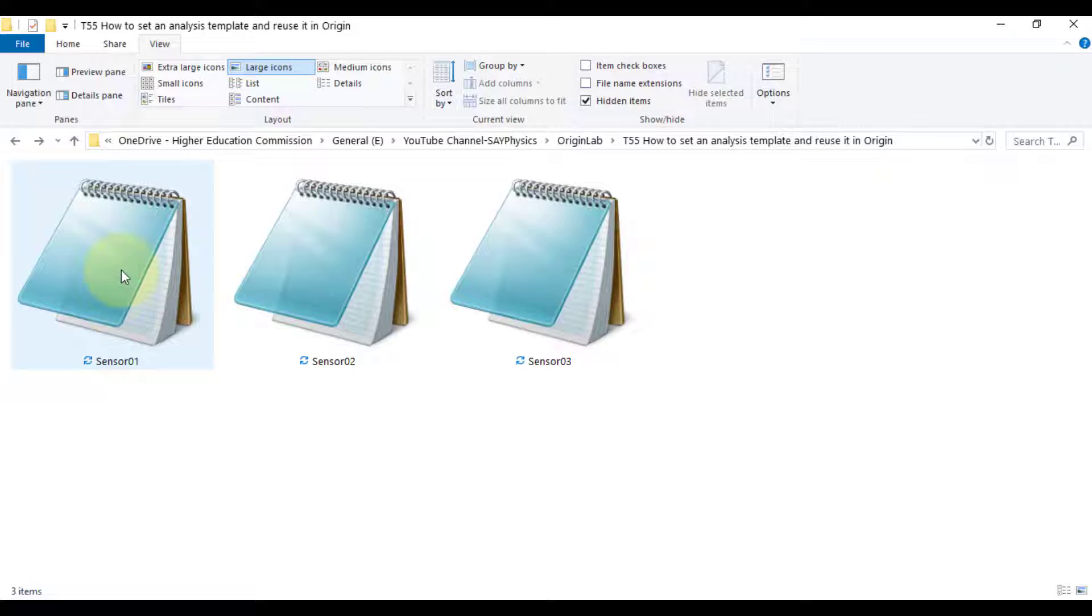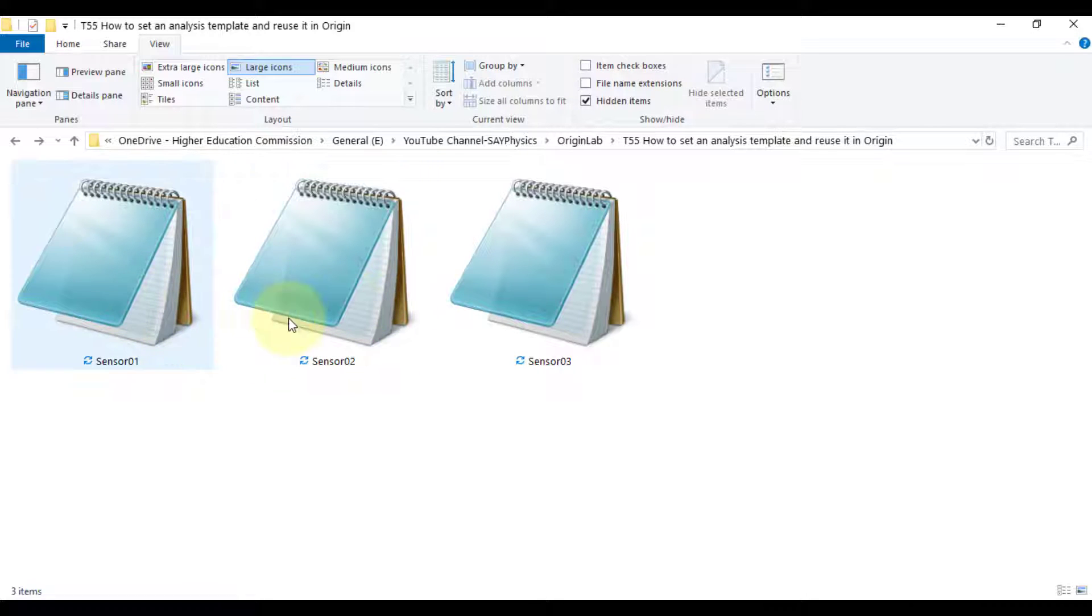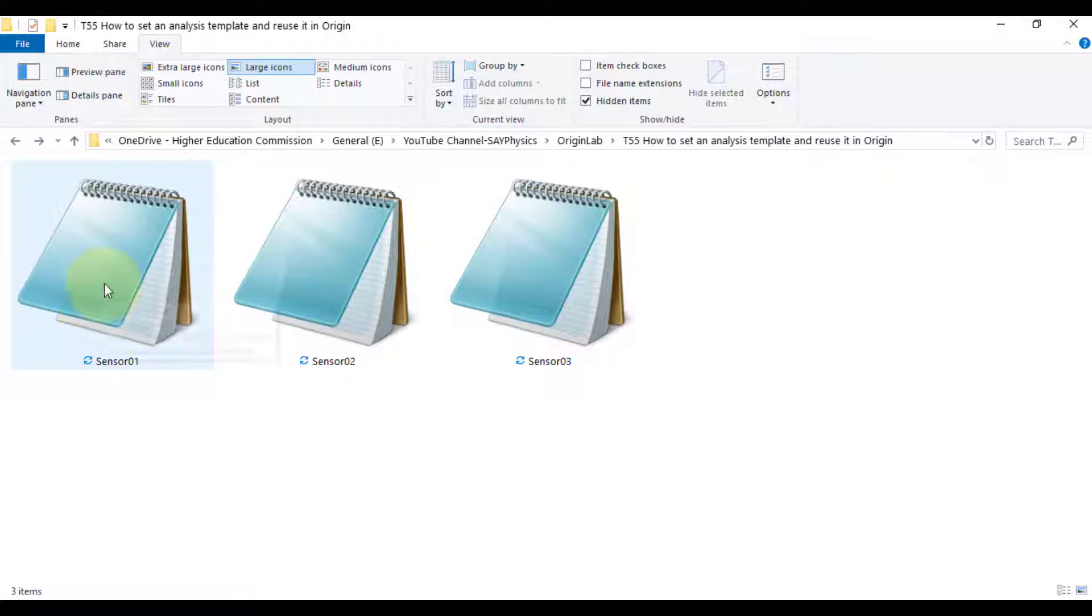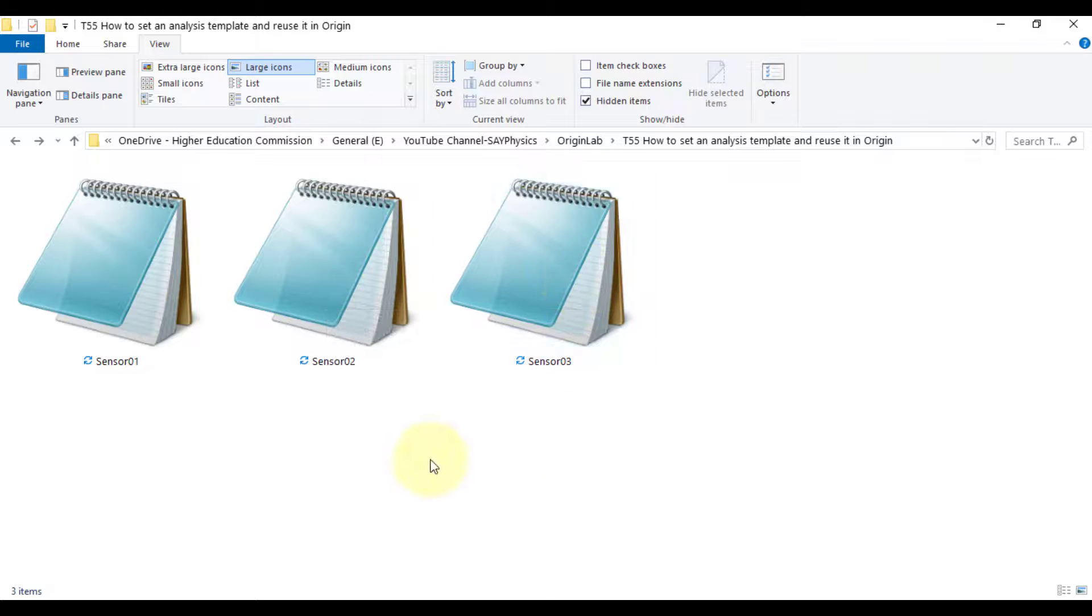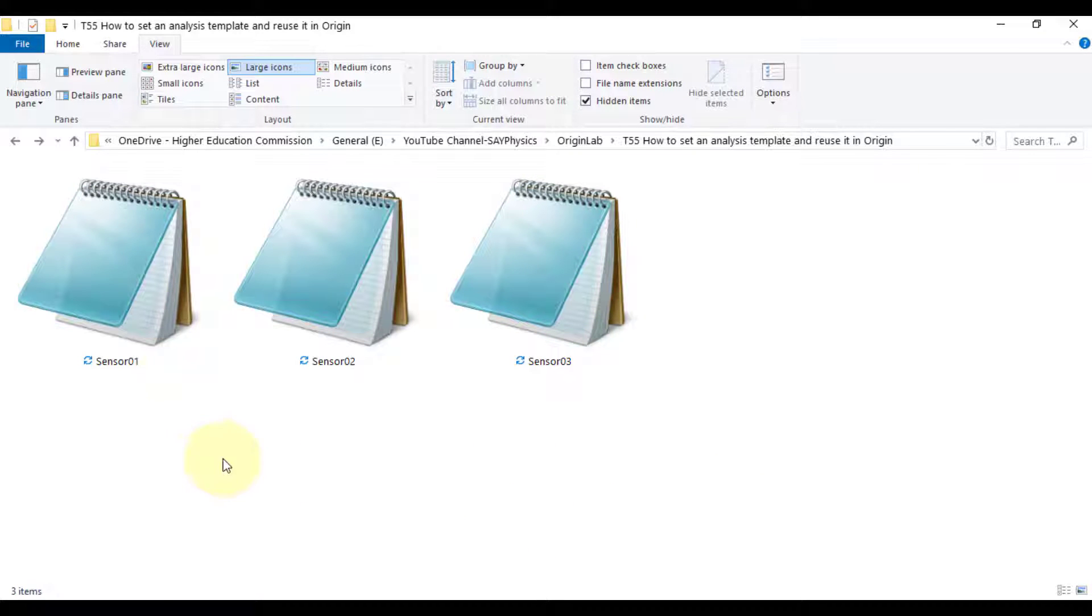This is the data of three different sensors. First, we will make a template on the data of sensor 1 and then reuse the template for the data analysis of sensor 2 and sensor 3.